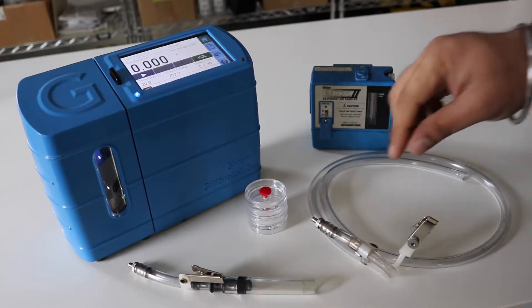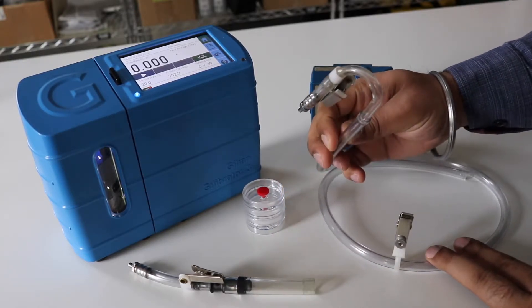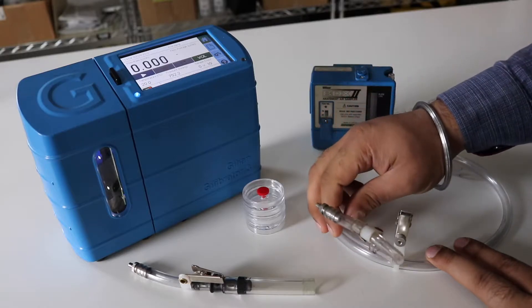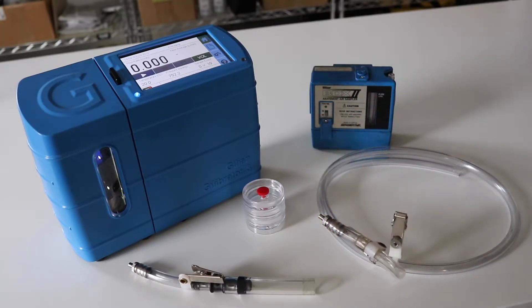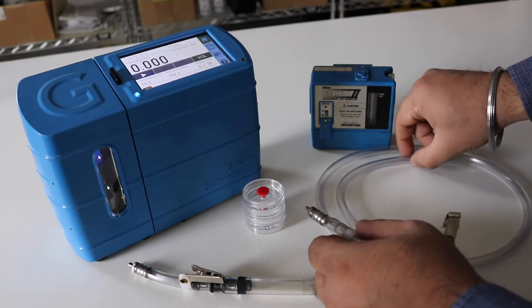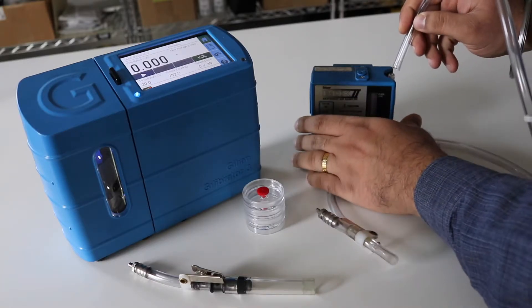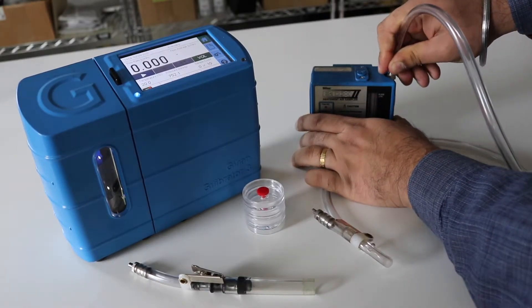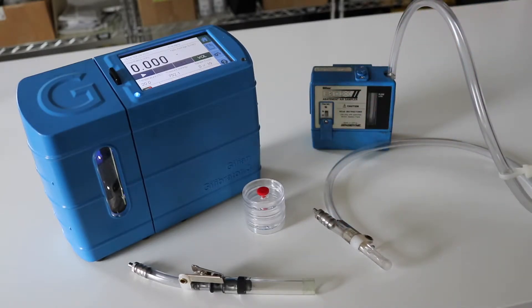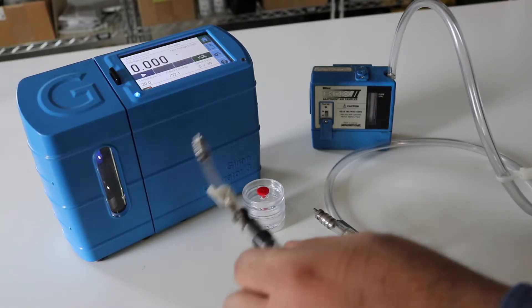Slide in any collar clips and insert the lower adapter to the connecting tubes. Insert one end of the flexible tube to the sampling pump. Insert another flexible tube to the Gillian Gilibrator 3 calibrator.